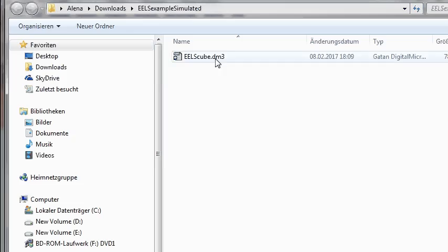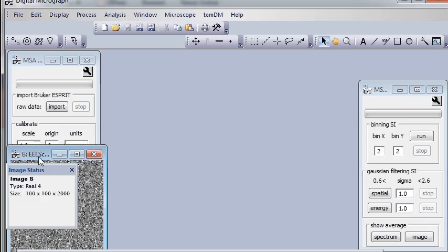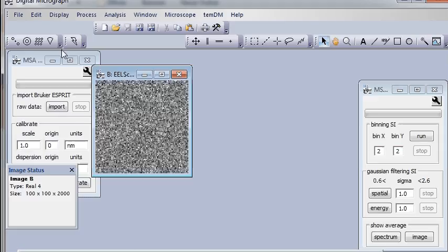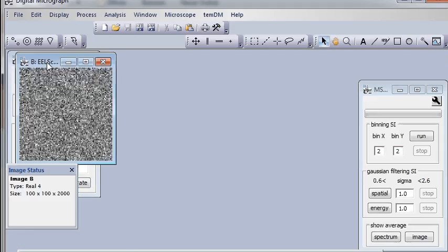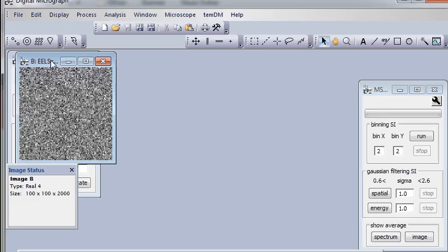It's called EELS cube. Here we are. And you see that this is 100 by 100 pixels and 2000 energy channels. How can we see the hidden energy dimension?